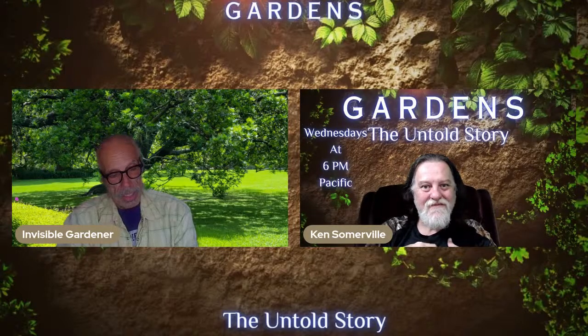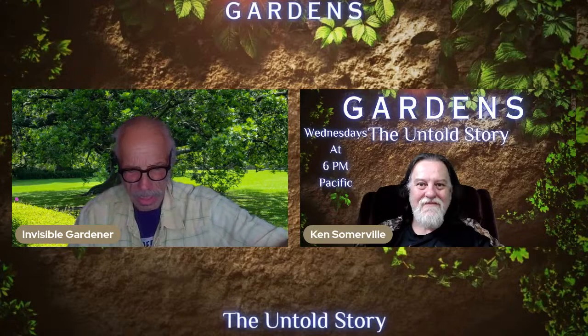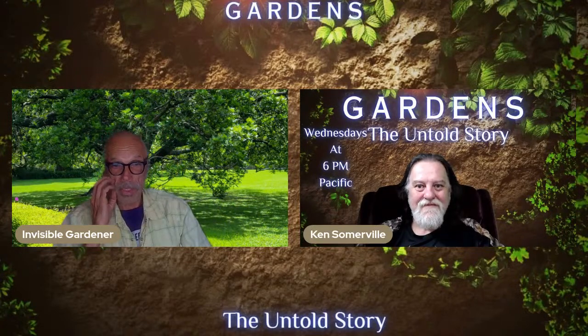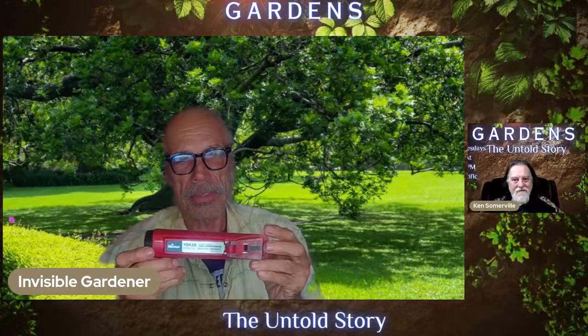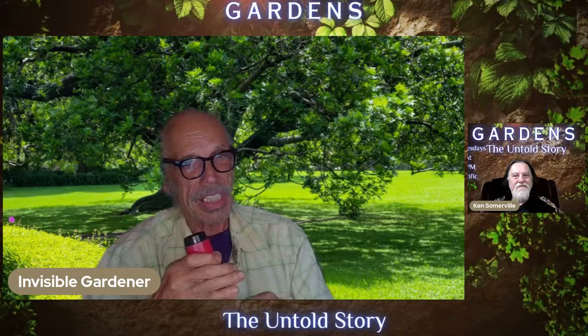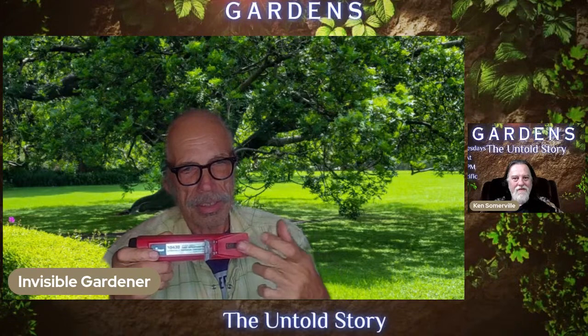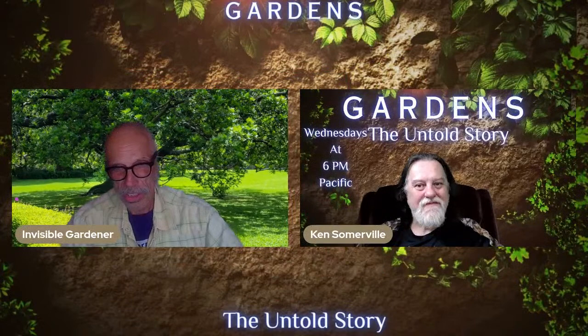Then I heard about a person who invented the refractometer. It was a cook, and the one I showed you last show was given to me by him. It's from Leica, the lens company, the camera company. They make this one, and this was a $10,000 unit back in, let's see, what year was that? 78, I think it was 79, 80. And it has a top on it, and this is where you put your product sample in. You sample it, and you look through the lens. It'd be really cool if we could somehow blow up how you could see through the lens.